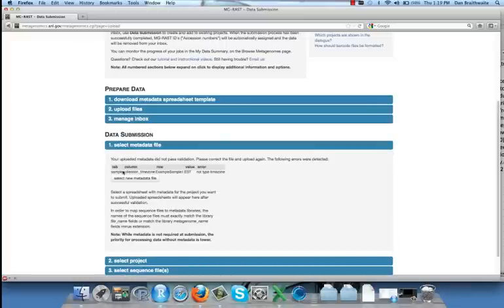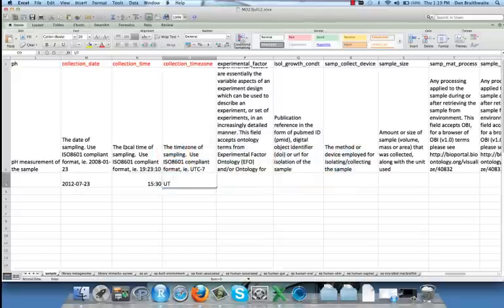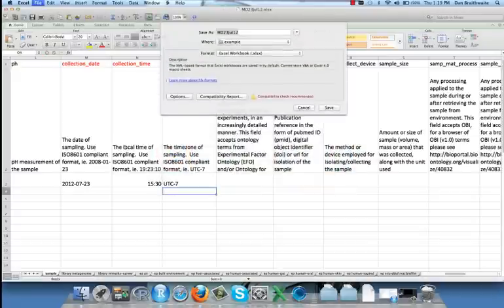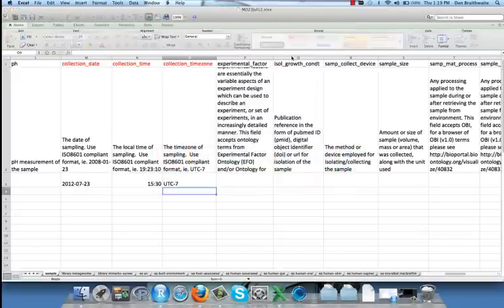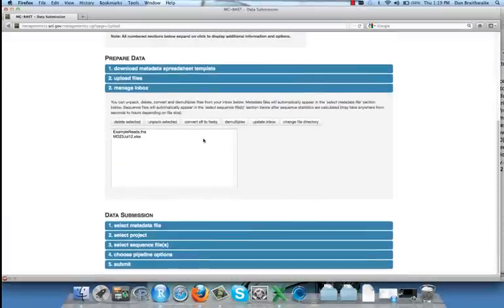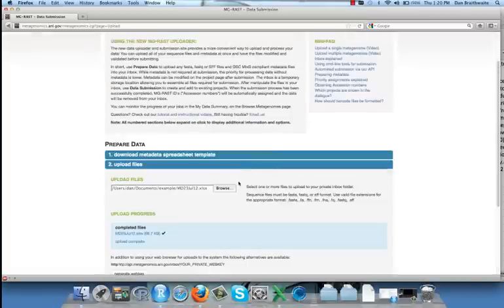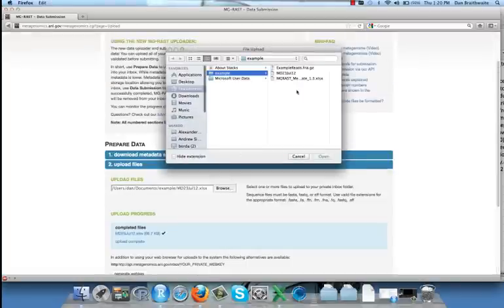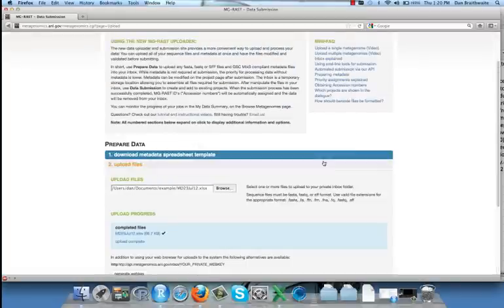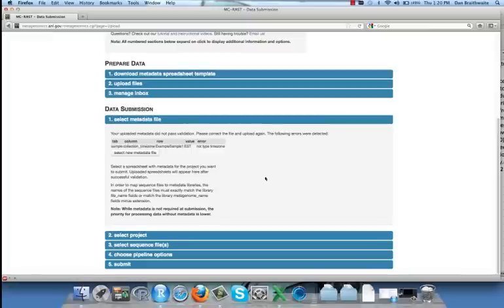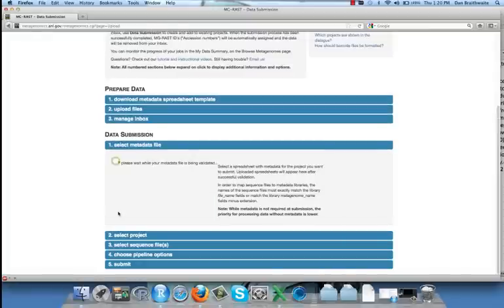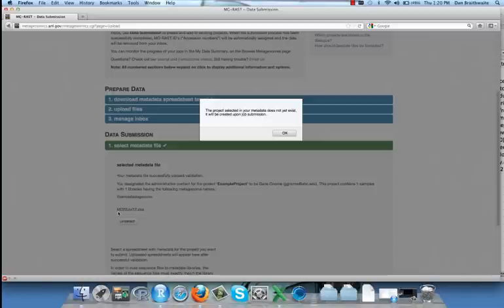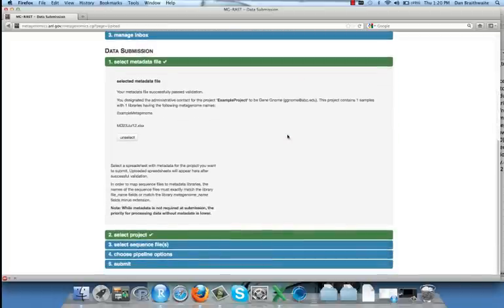We return to Excel to fix the problem. We again save the local version. Before uploading again, we first delete the old version from our inbox, and then we proceed as before, first uploading the spreadsheet, and then selecting it. This time, the spreadsheet passes the validator, and the message from MG-RAST indicates that the metadata spreadsheet will apply to a new job rather than an existing job. Now we can continue through the rest of the job submission process.